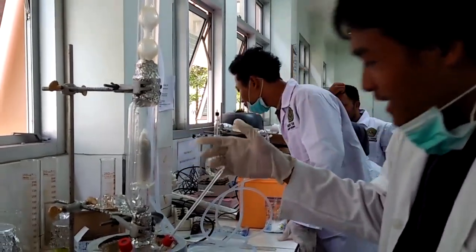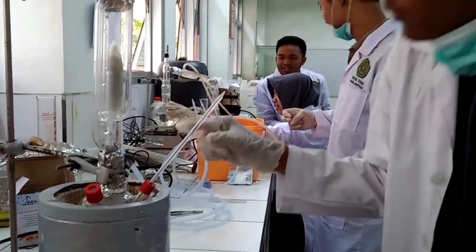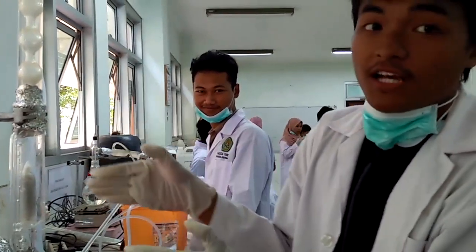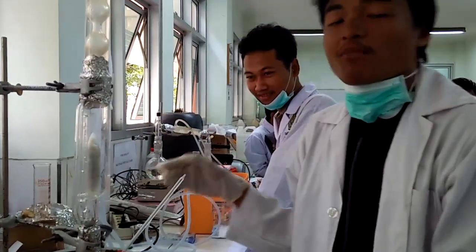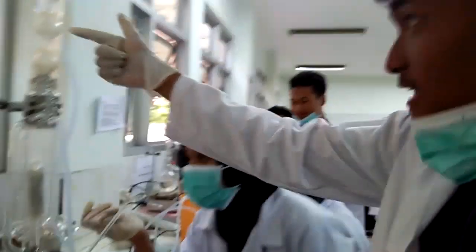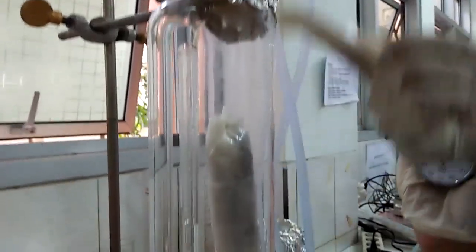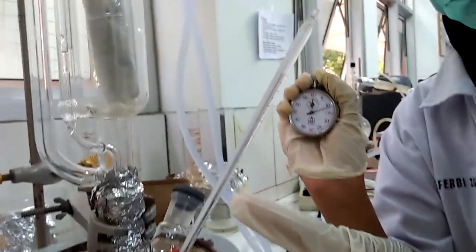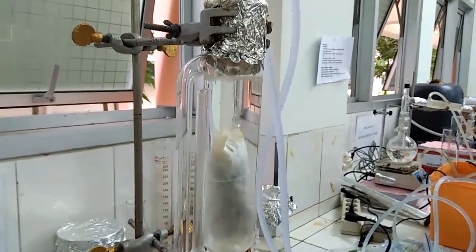Dipasang aluminium foil di samping alat untuk mencegah terjadinya penguapan pada labu. Setelah itu sudah siap untuk melakukan proses ekstraksi minyak atsiri. Pelarut yang digunakan yaitu etanol akan menguap pada suhu antara 70 sampai 80 derajat. Setelah terjadi penguapan, uap tersebut akan didinginkan oleh kondensor yang kemudian akan membentuk tetesan-tetesan cairan yang akan memenuhi tabung sokletasi. Setelah cairan terakumulasi dan tingginya mencapai pipa kapiler, maka akan terjadi sirkulasi, di mana cairan turun menuju ke labu.